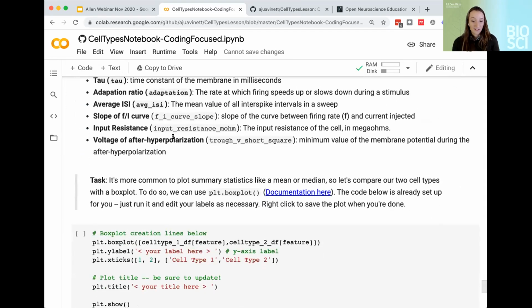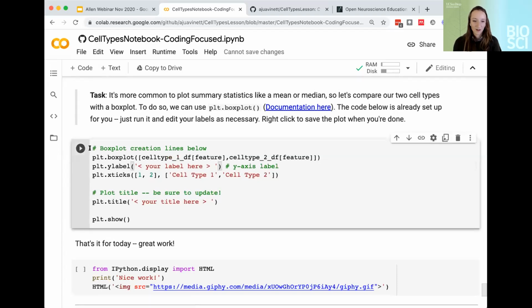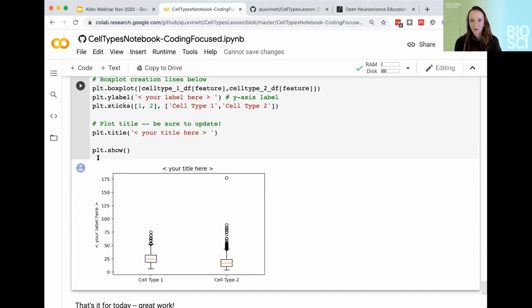Finally, you might want to plot this as a box plot. So here's another way to plot this too. You could go down here and this will replot it. Instead of a histogram, it'll plot it as a box plot, which of course gives us a little bit more of a summary of the data, which can nicely be a final summary plot for students.